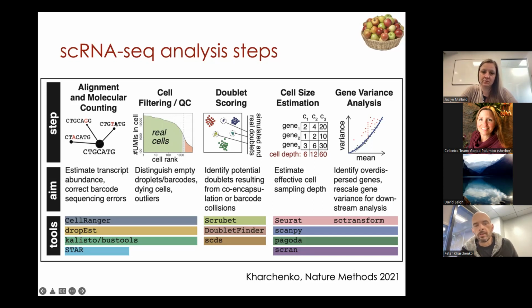So this is just likely to be a sequencing error, so we will treat all these reads just as one molecule. So a number of heuristics like this are built in, and they work up to an extent. So for instance, if you have a lot of sequencing errors, that will lead to overcounting, let's say, of molecules.